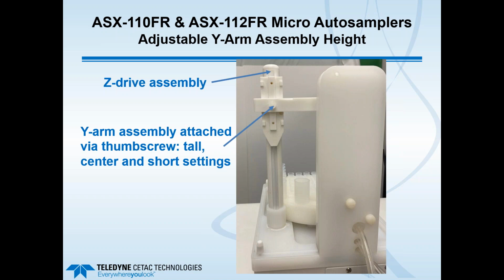I will point out at the lower right-hand corner of the picture, you see a little bit larger piece of PVC tubing. That would be the gravity drain tube that comes from the rinse station. That will carry any overflow waste to an appropriate waste container.